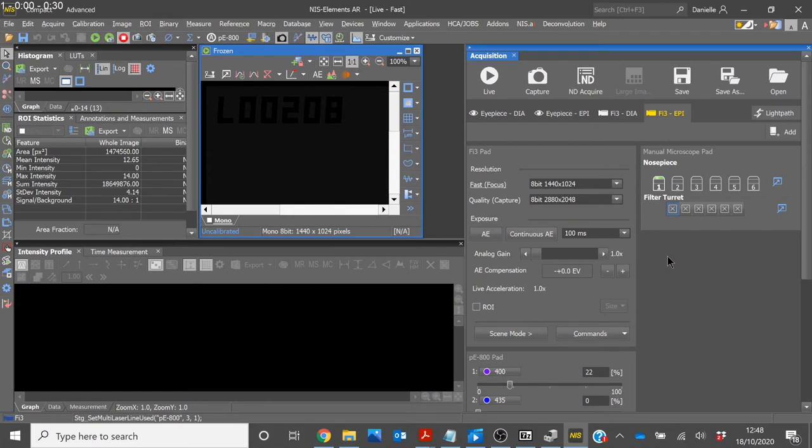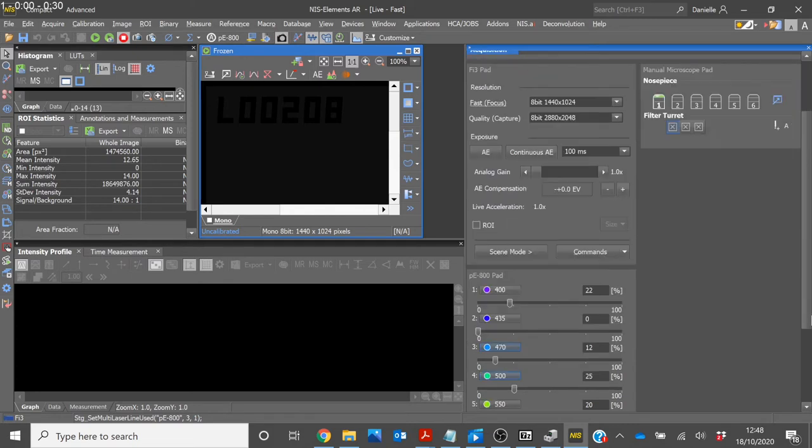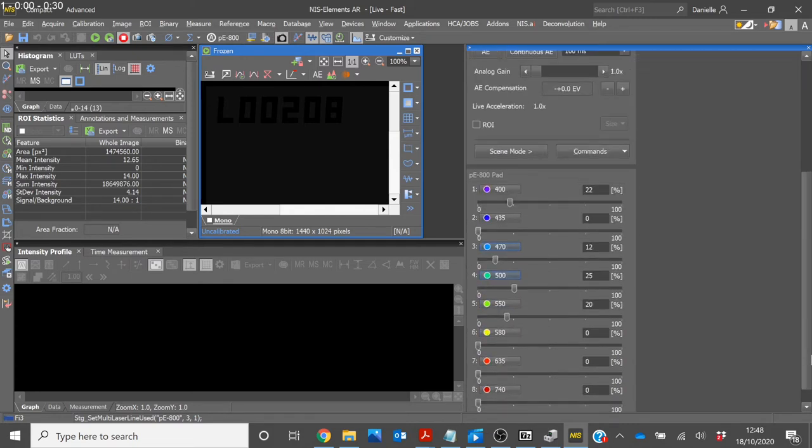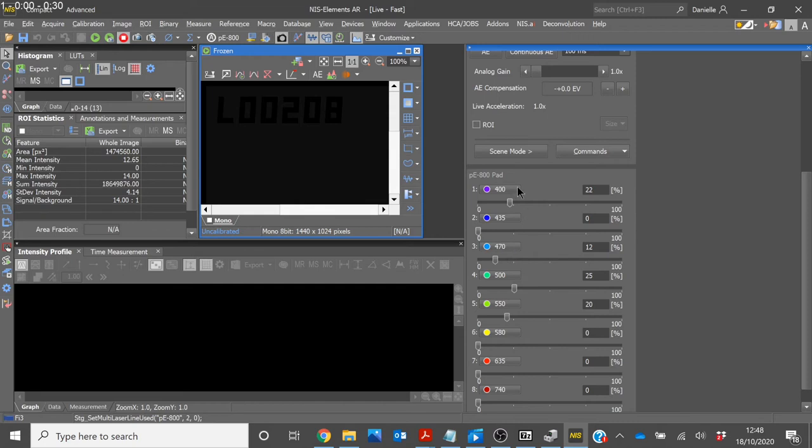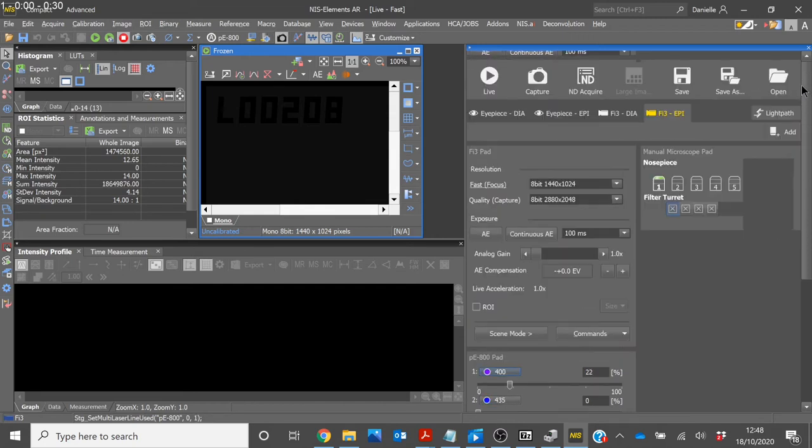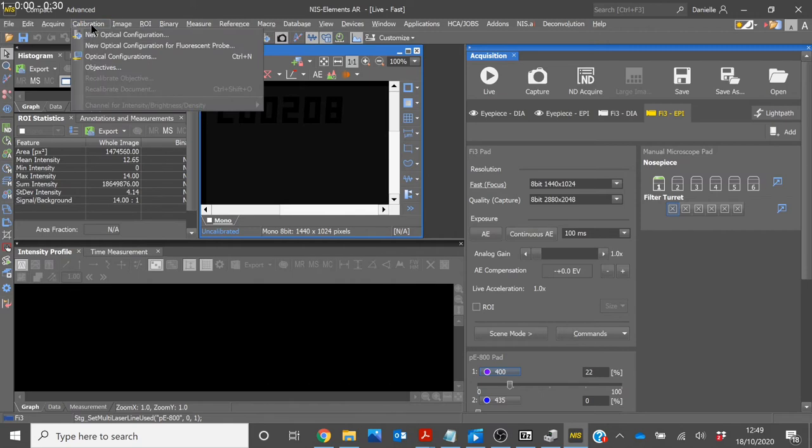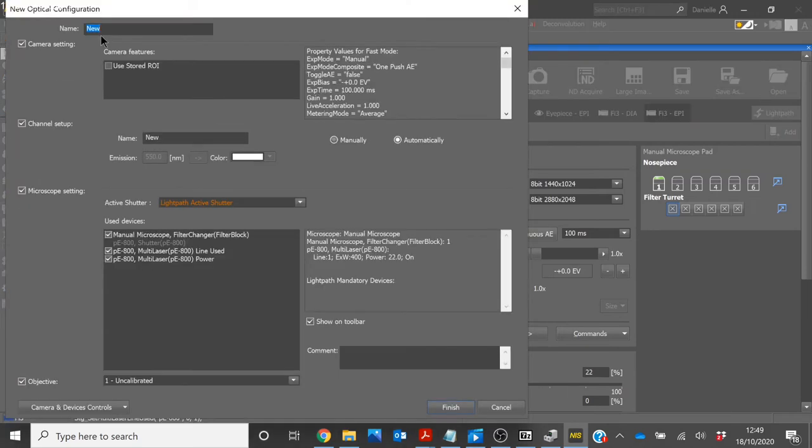If you wish to run an experiment, you will need to set up some optical configurations. The easiest way to do this is to first of all select the wavelength and intensity required on the PE800 pad. For this example, I will be setting up a DAPI channel. You can then either select Add under the Acquisition window or you can head to Calibration in the Toolbar and select New Optical Configuration.